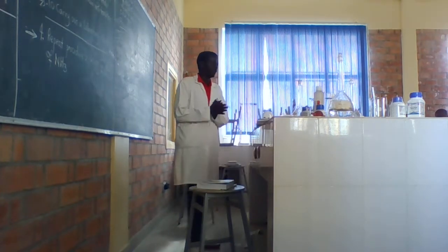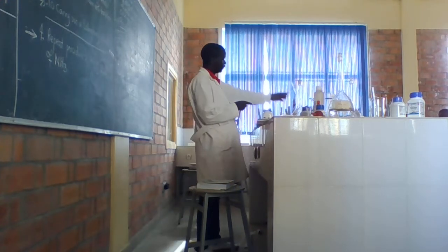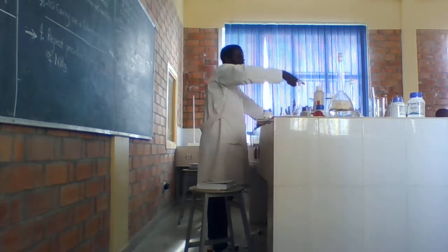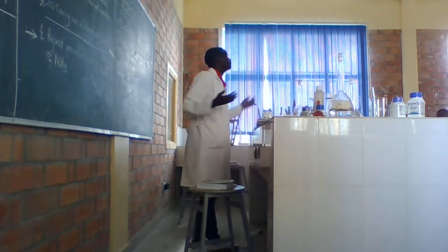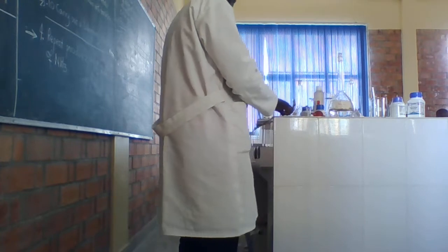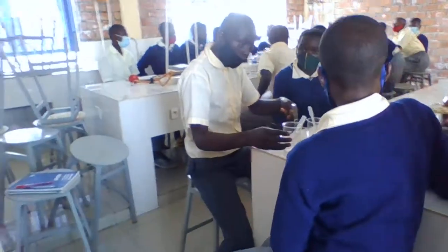Okay, you start the experiment. You take the first test tube for the first experiment, the second test tube for the second experiment, the third for the third experiment, and so on until you finish. Okay, you begin the exercise. Start.